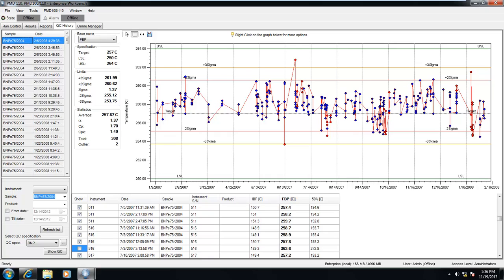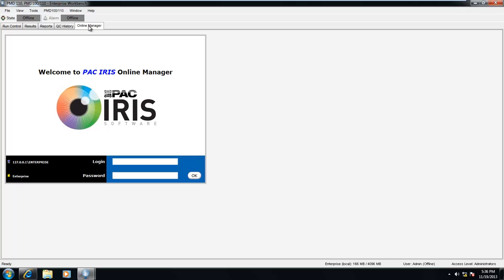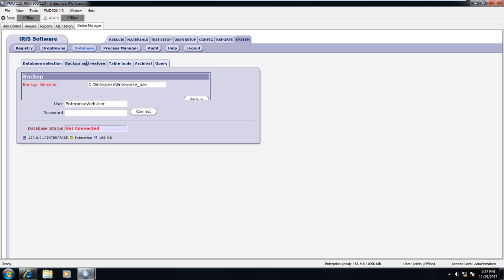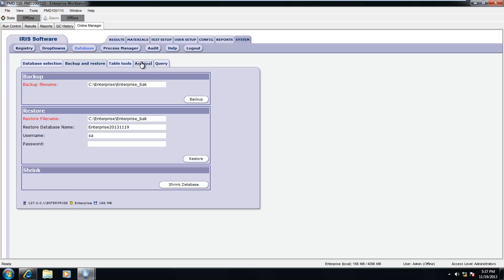Now that we've covered all common components of the lab user's interface on the workbench, we can take a look at the functions of the online manager. You can access the online manager through the online manager tab in the workbench or by exiting to the desktop and using the hyperlink provided there. This will require authentication. Once credentials have been provided, you can access the system administrative and reporting functions. The system can be set up to allow multiple users access to all or separate instruments with any number of privileges for each, adding a level of security unique to IRIS. All database functions are available through the systems tab, including the option to backup, restore, or archive old results.